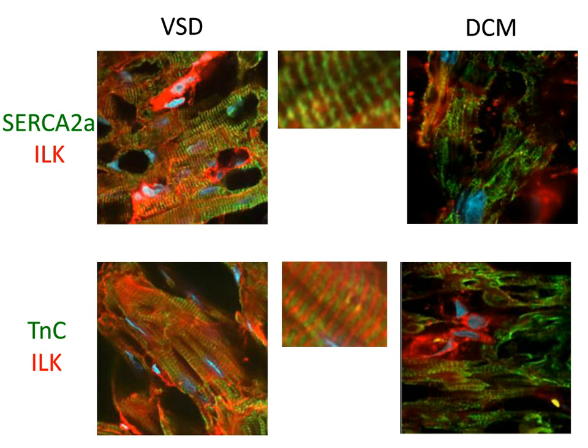That recycling of the calcium back into the SR is what generates force contraction in the cell, in the cardiomyocyte in particular. And so pathognomonic for heart failure is a decreased activity of SERCA2a and an increased cytosolic calcium level with a decreased sarcoplasmic calcium level. And so what we showed here is that in normal functioning hearts, VSD hearts, integrin-linked kinase, or ILK, overlaps with SERCA2a very well.